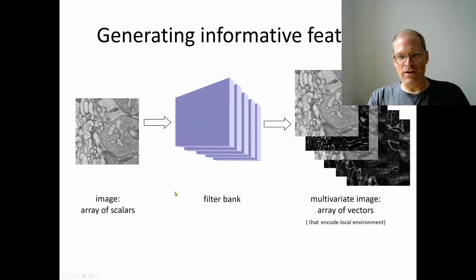Right? So finding or using the right features, there is a little bit of experience that goes into that. And once we have created our feature space, let's say prior to neural networks, this was really all about experience.